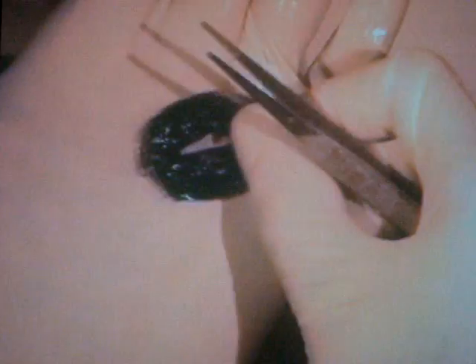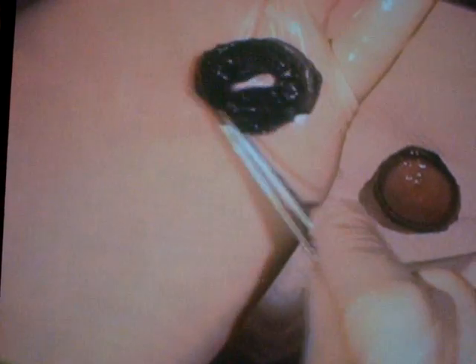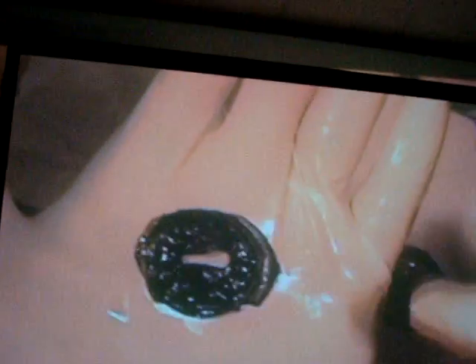Here we have a ring of smooth colored muscle called the iris. If a person's eyes are brown, the iris appears brown. If you have blue eyes, your iris appears blue. So the iris gives each one of us our different eye colors. Cows only have that one brown color — they don't have different colored eyes.